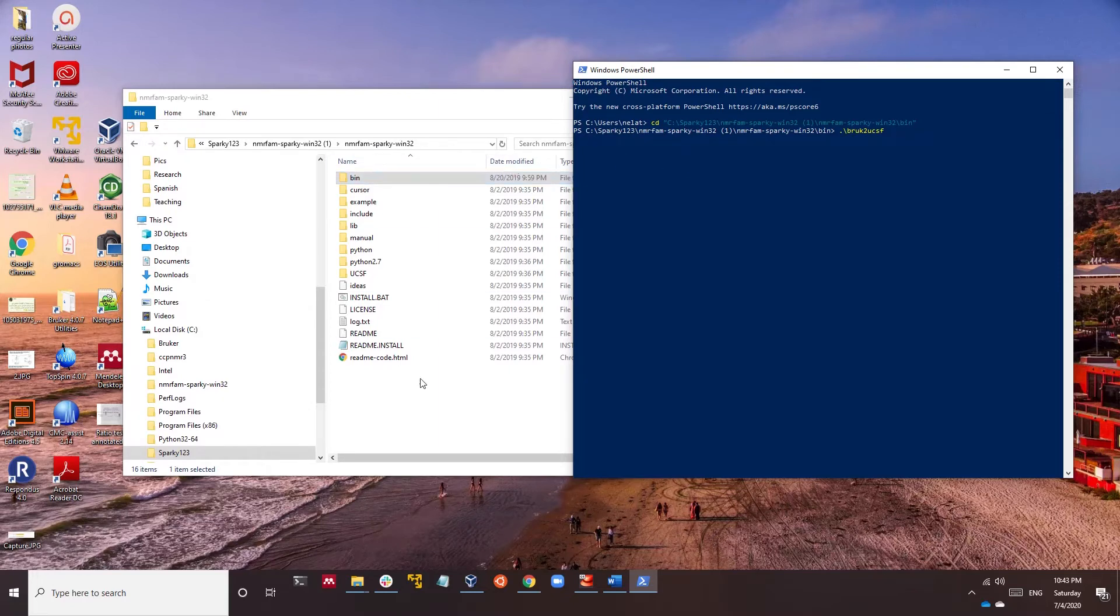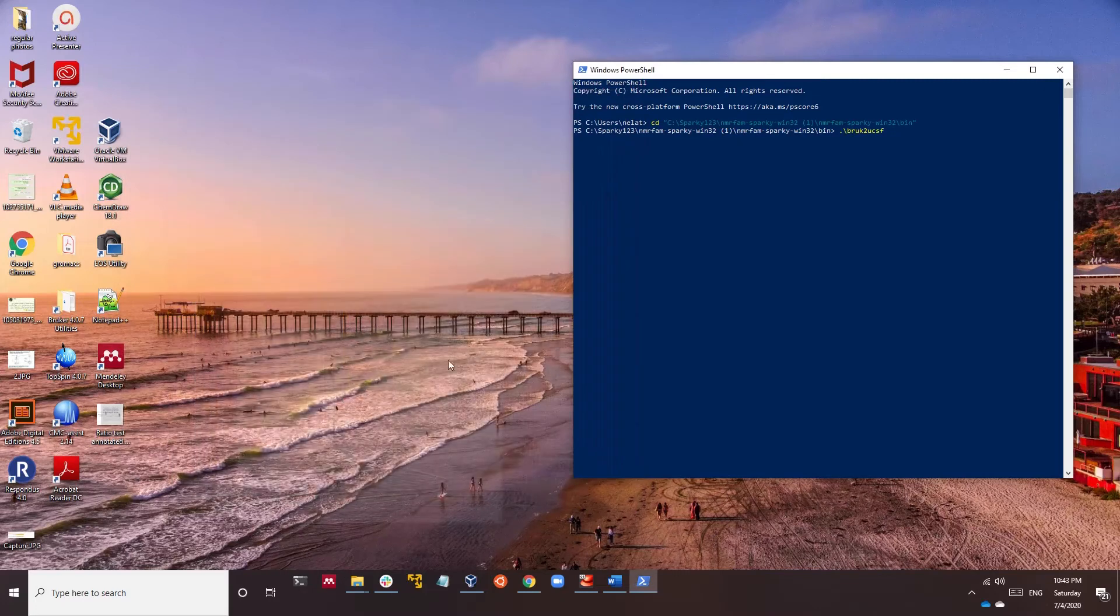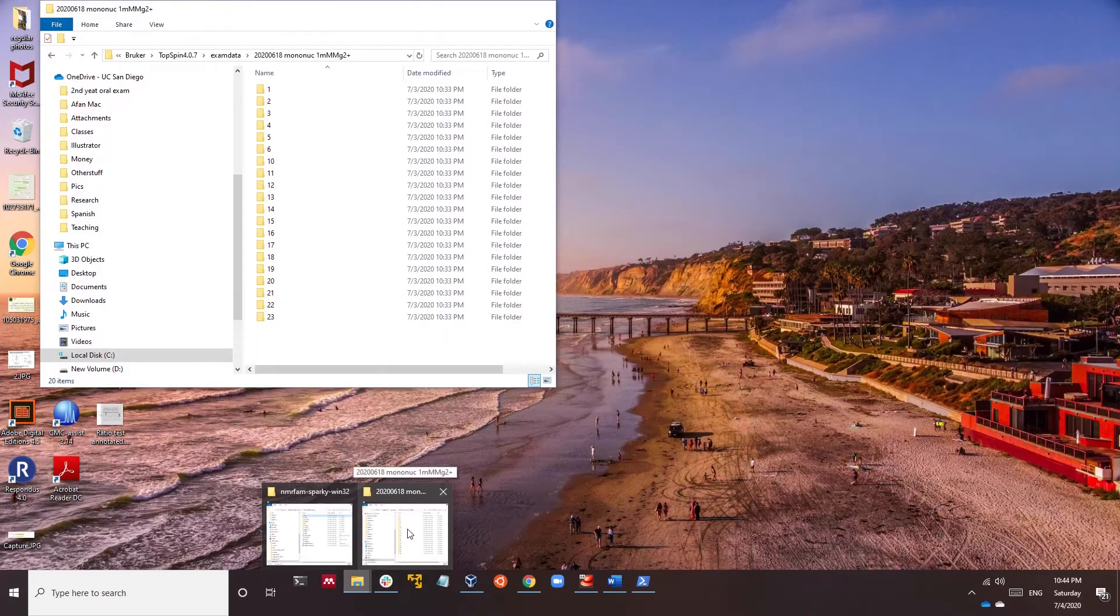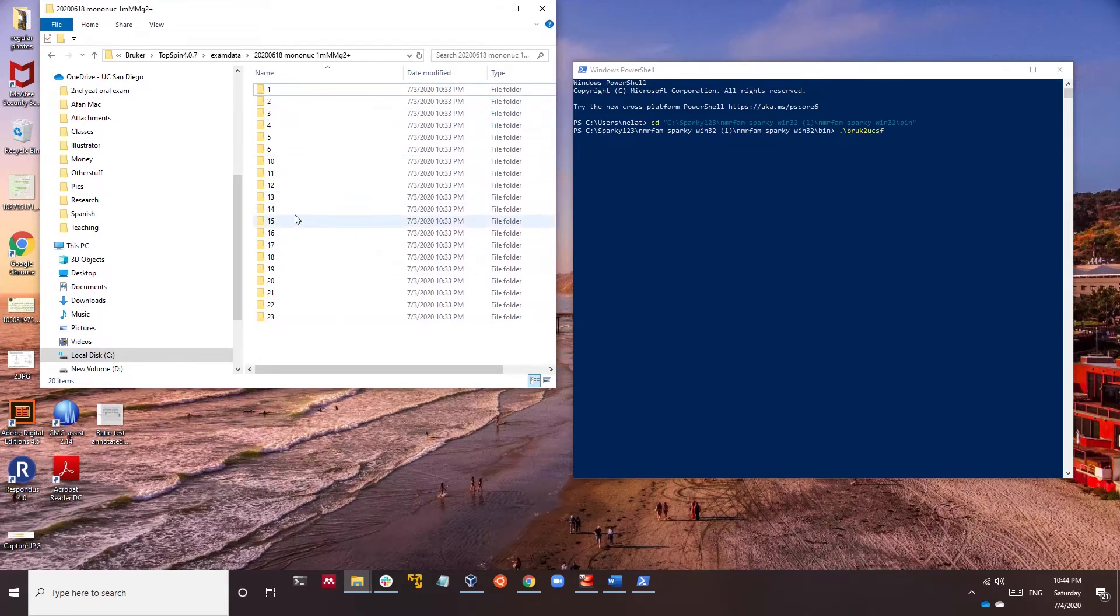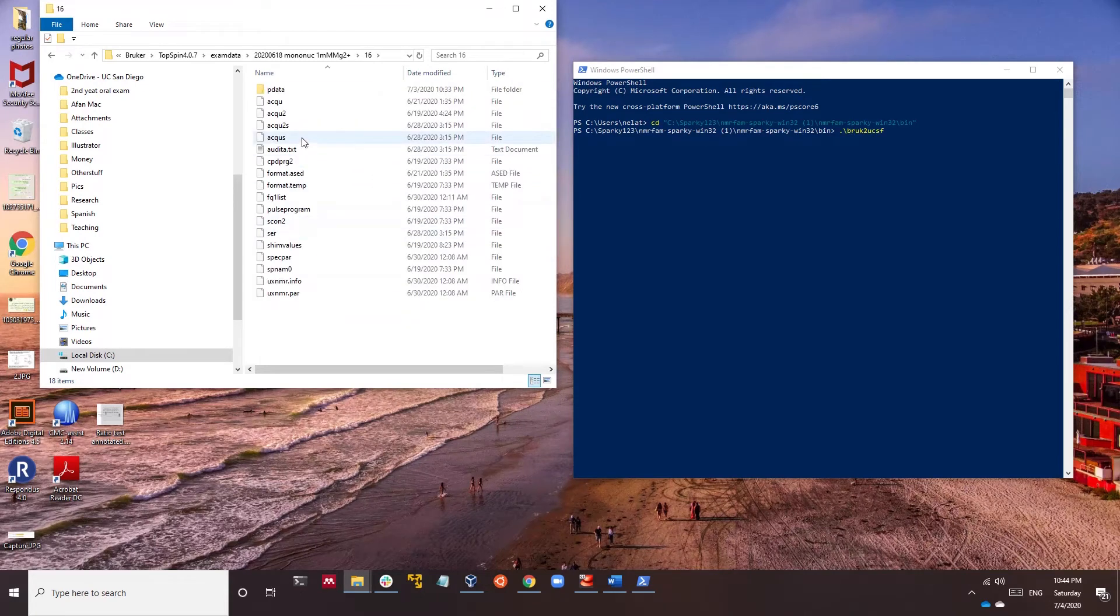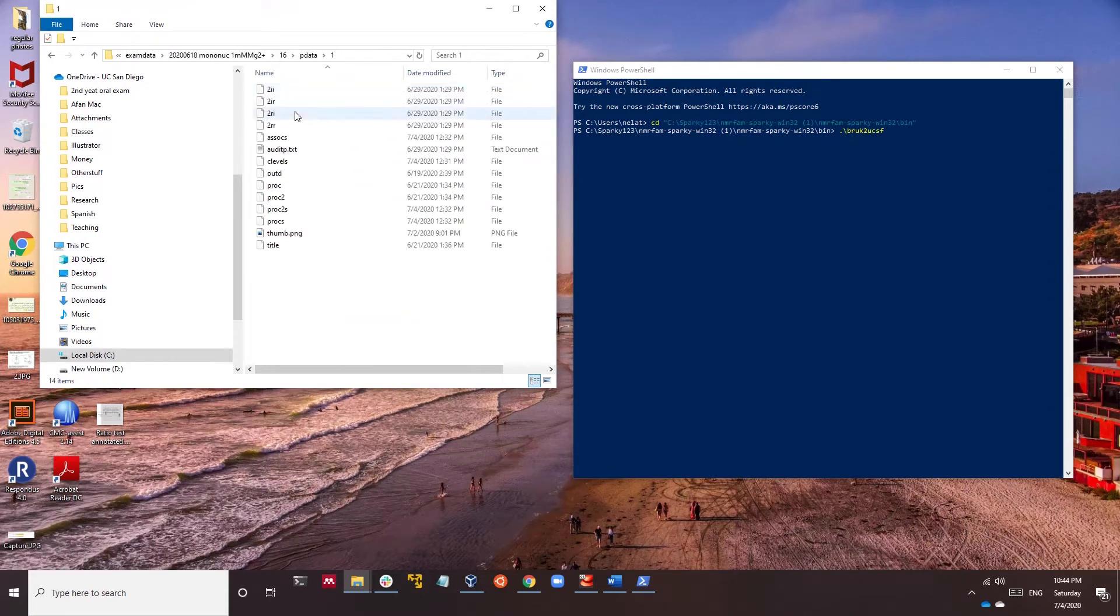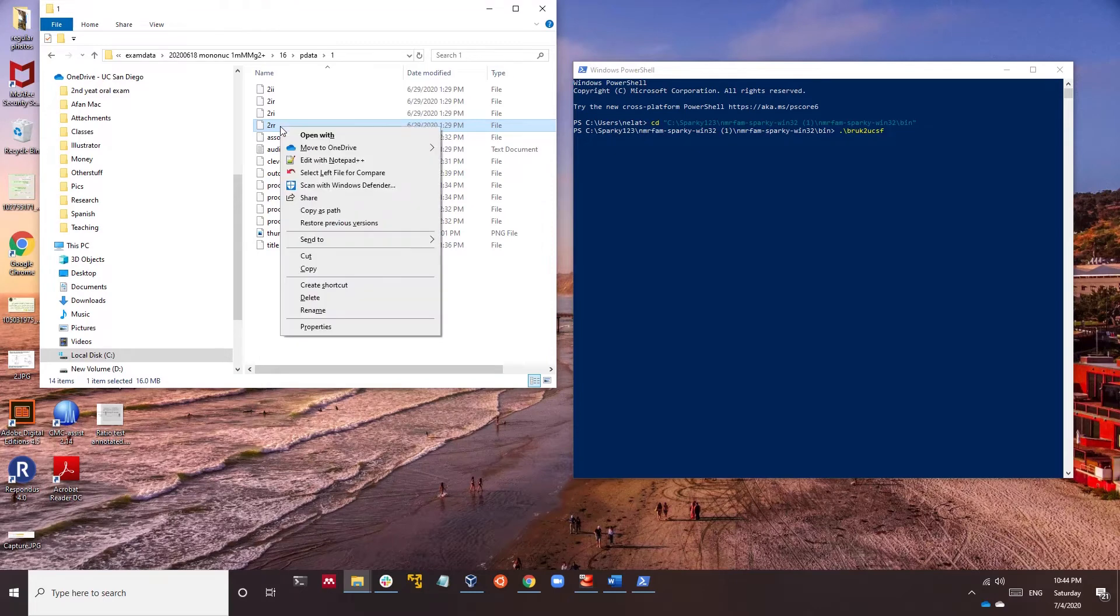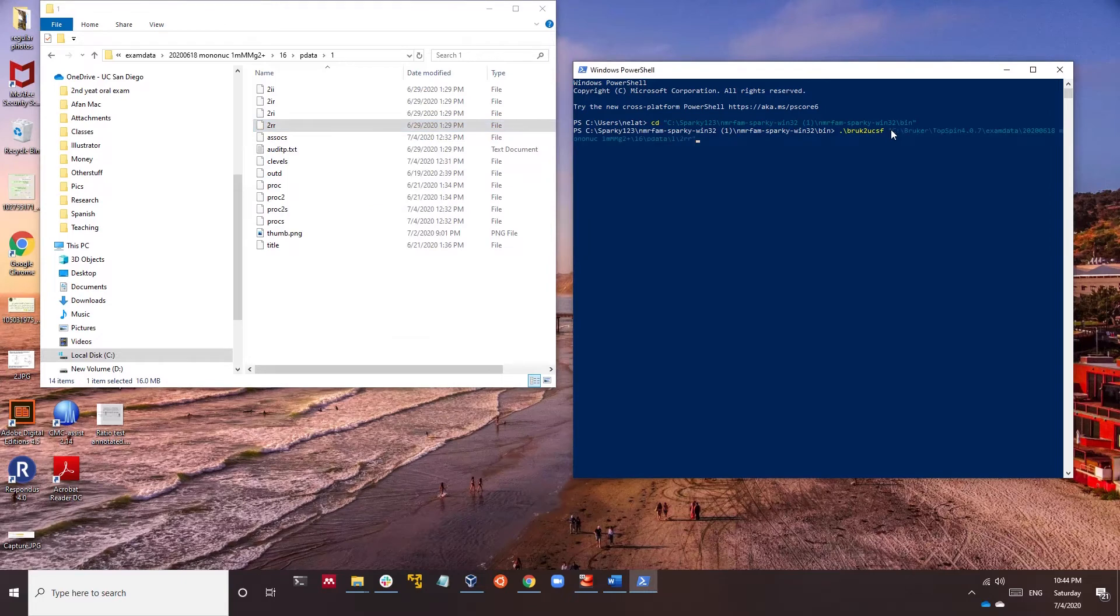To find one of the Bruker files, you can go to your data. For example, this experiment 16 - you want to convert the 2RR which is the 2D NOESY file. You can hold Shift and then copy as path and you paste it here.